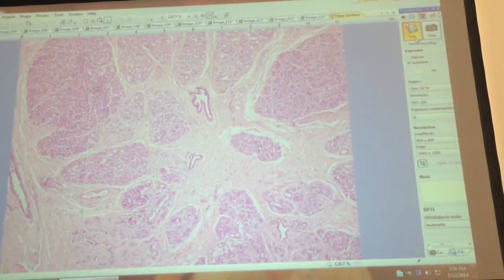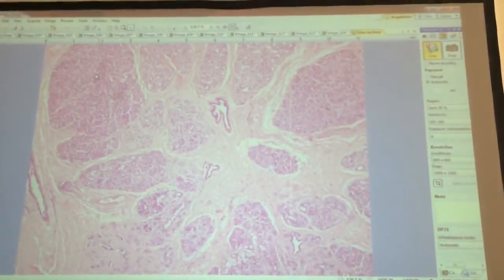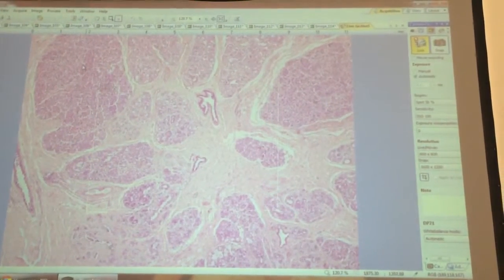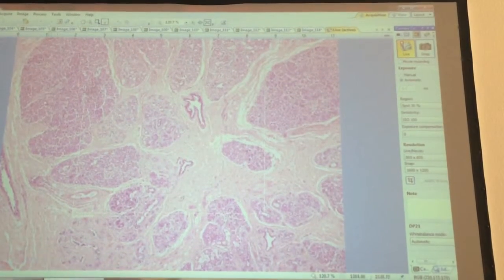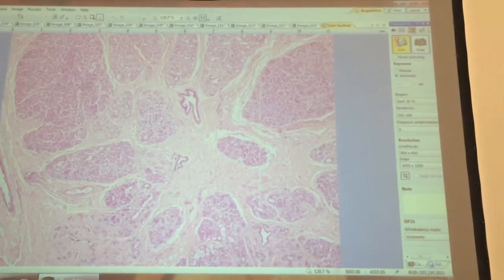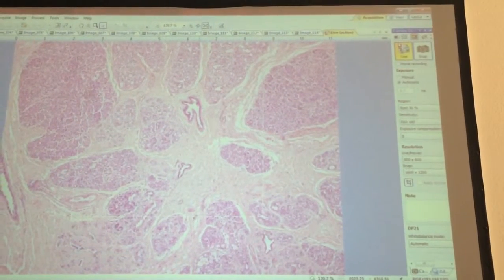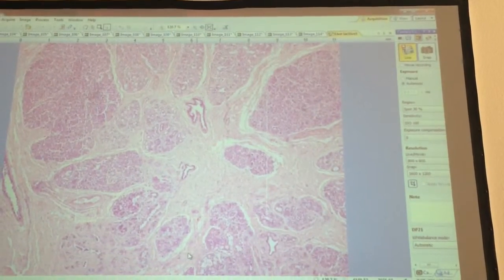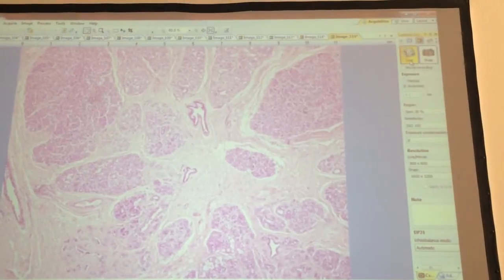and beyond pregnancy. All of this here is glandular tissue. Okay, so the structure of the mammary glands actually change quite a bit, and you're going to build those glands in response to the hormones that are present at the end of pregnancy. So you should see a lot of glandular structure here. You'll see ducts of various sizes. That's a duct, that's a duct, that's a duct. You have your connective tissue, septa, that you're seeing in here. And then you should see some adipose tissue. So let me take this picture if I haven't done so already.